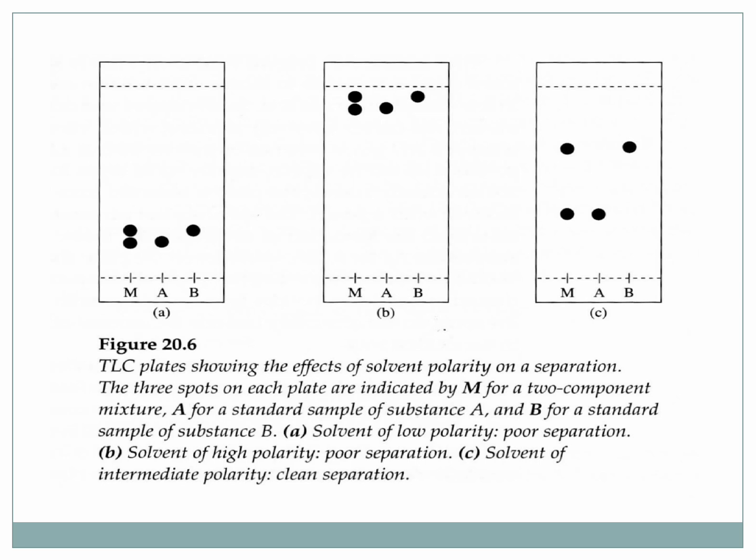Right now we're just looking at the mixture. We technically separated it with those 2 little spots, but in those 2 little spots is probably 1 milligram of material, and we probably started with 1 gram, right? So this is not a way that we can actually separate all of compound A from compound B. This is just a way that we can look at it, and we can find the solvent that is the best, and then we can set up a different experiment to use that solvent to actually separate these.